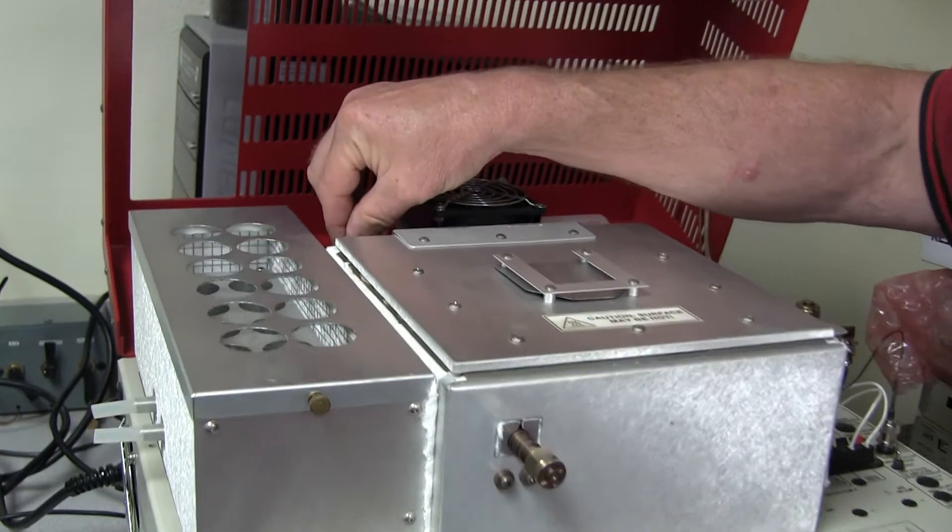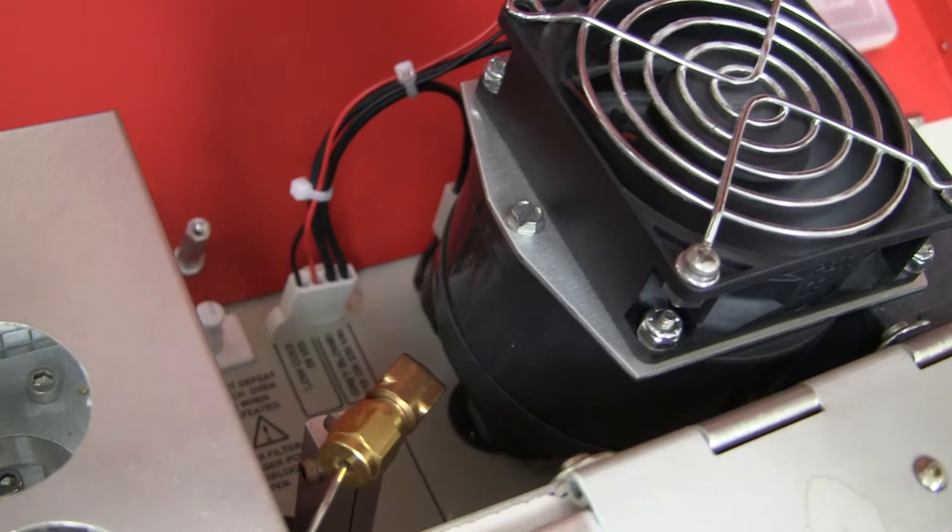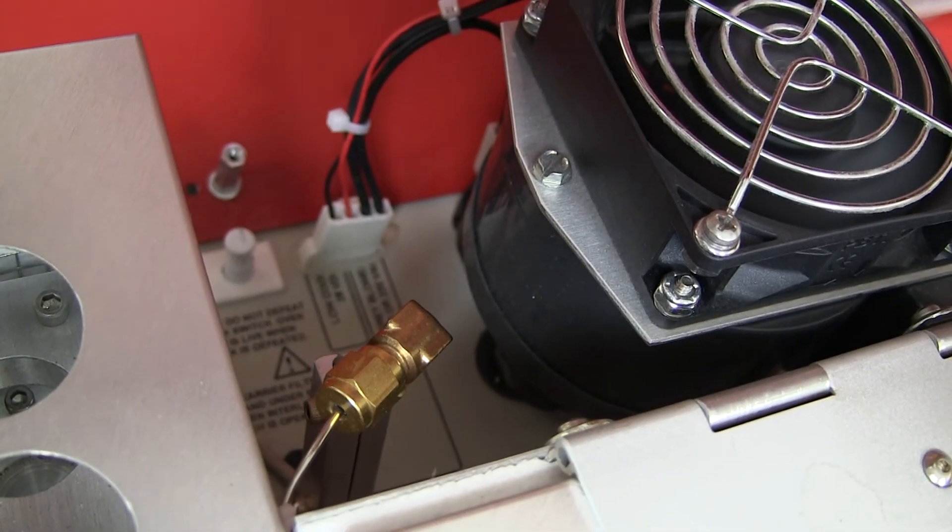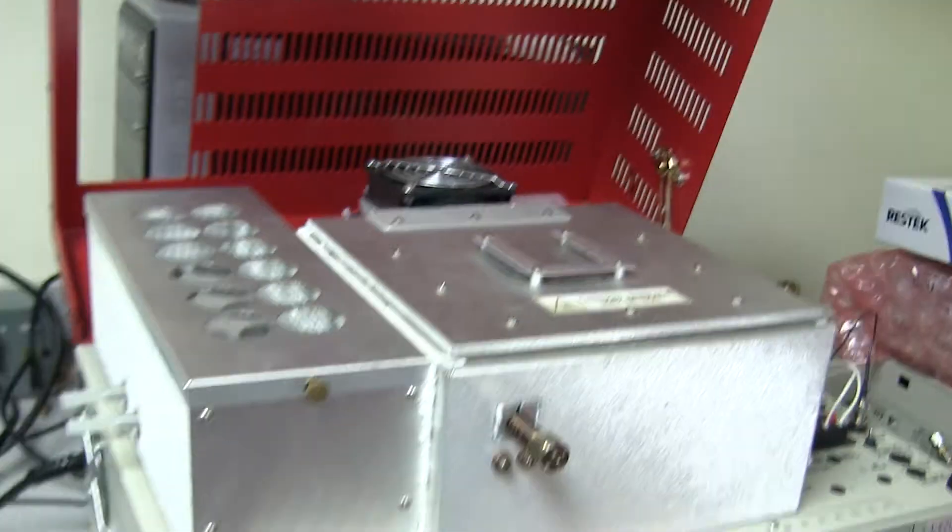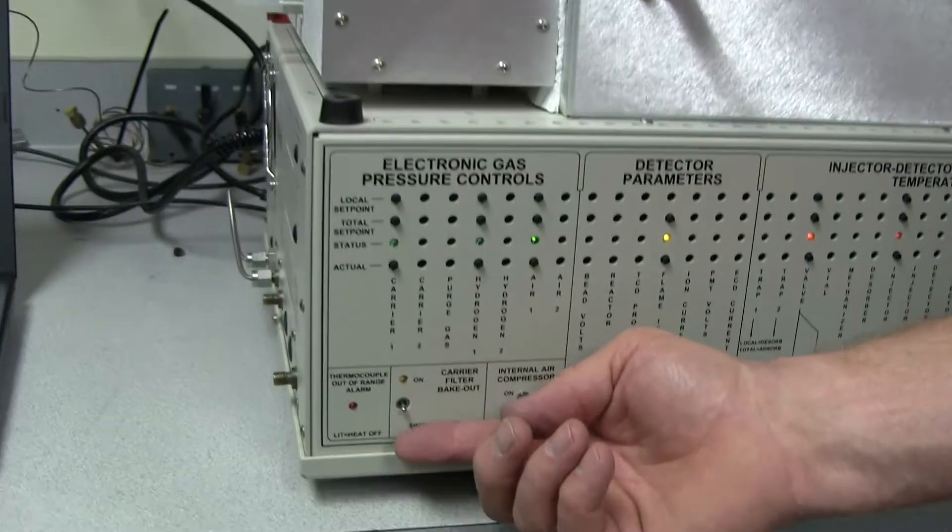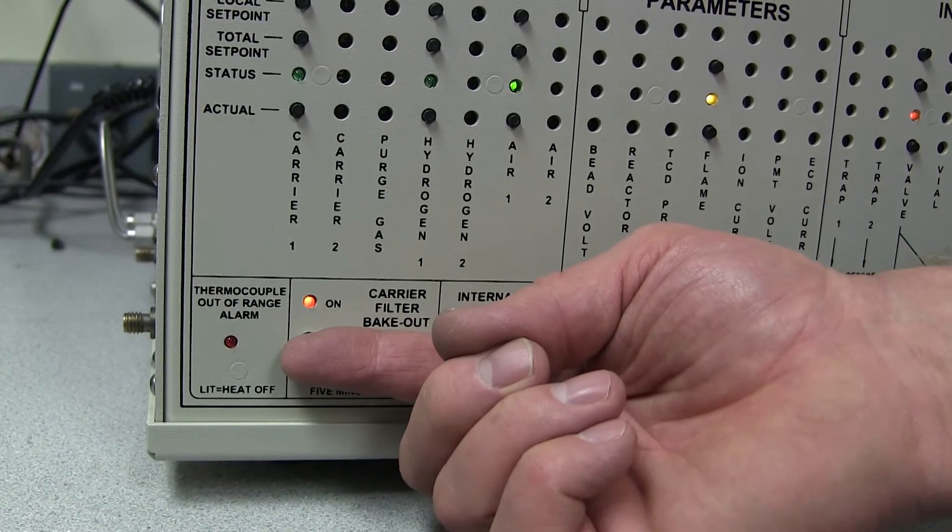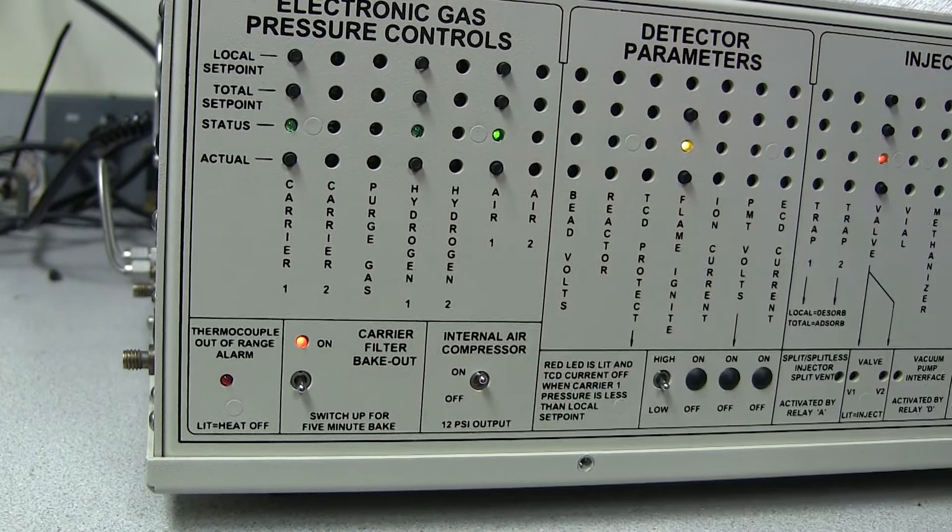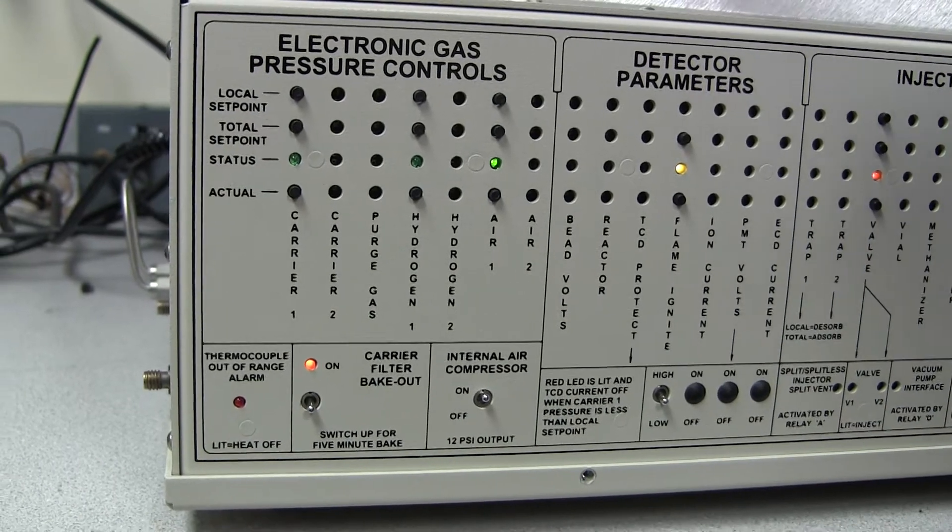When the polishing filter gets contaminated, it can sometimes cause drifting baselines or noise. So it's a good idea to periodically bake the polishing filter out. To do that, there's a switch on the front panel. It's a spring-loaded switch, so all you have to do is flip it to the up position, and the light goes on for five minutes, and the heater that's around the trap also goes on for five minutes.